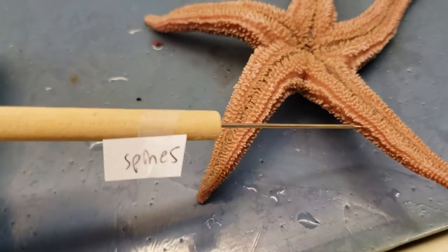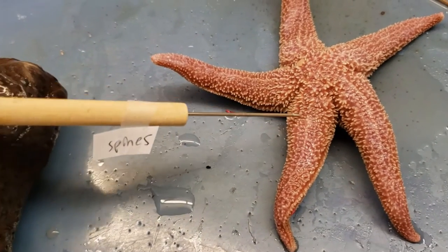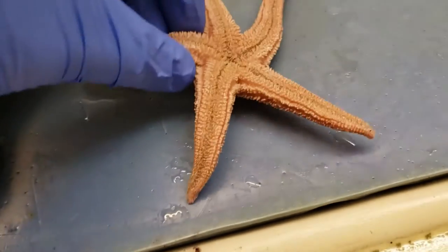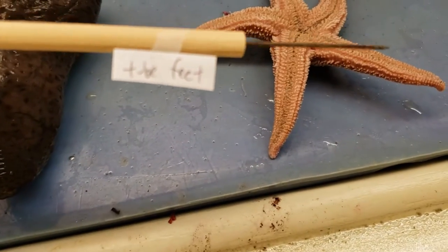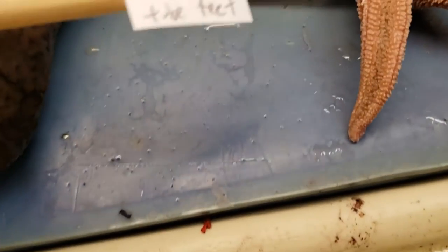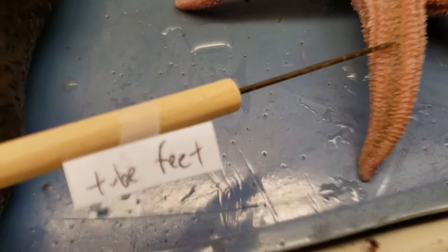Then you flip this puppy on over and we have spines all over the place. Now the tube feet are also another important structure — it helps these things navigate inside of their environment. It's a water-filled structure. The tube feet are in these little grooves in here, so they're not the spines, they're the tube feet.